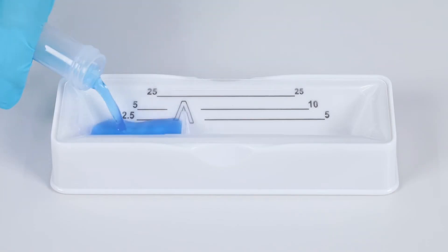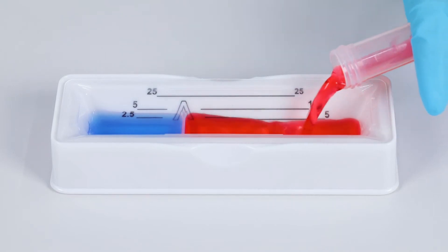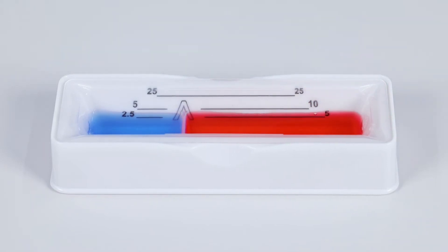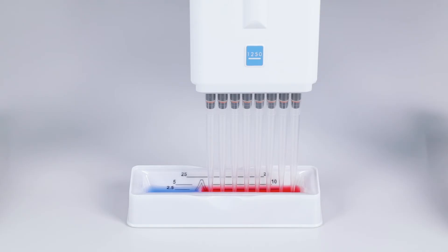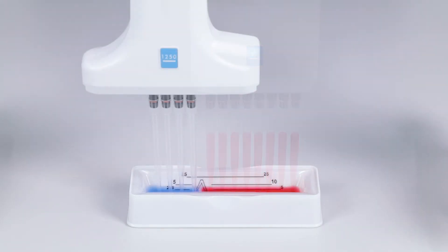Here's how it works: 5 ml and 10 ml troughs are positioned for use with all multi-channel pipettes, resulting in the lowest possible dead volume regardless of your application.